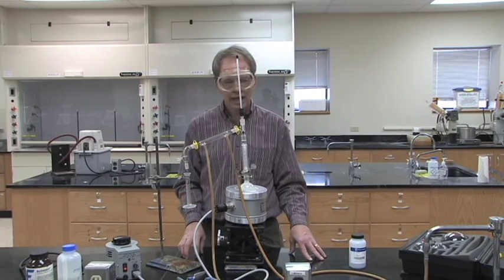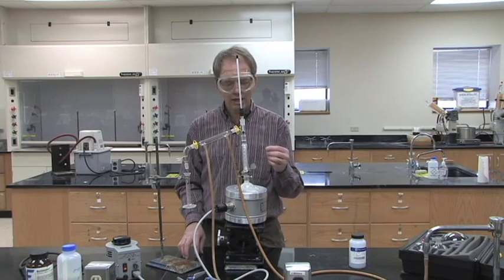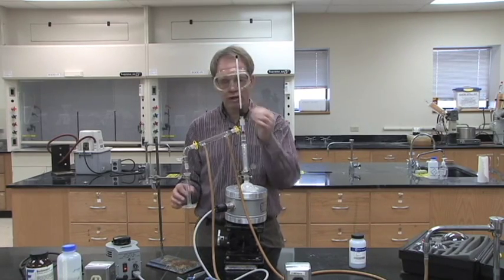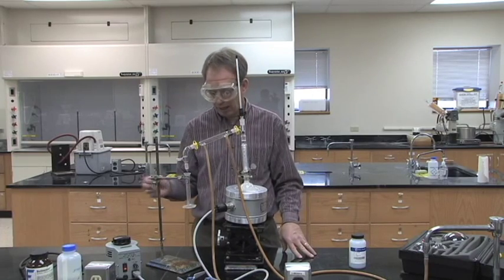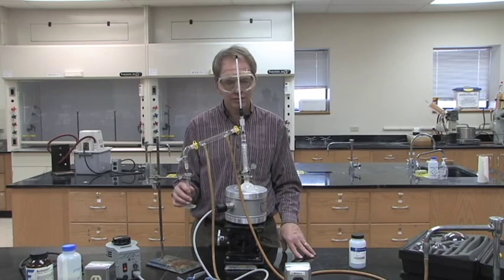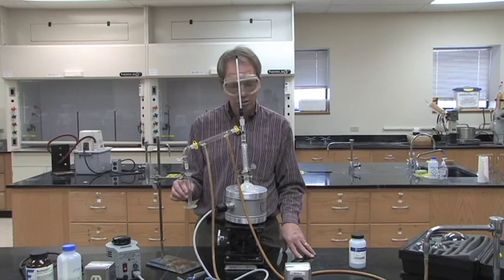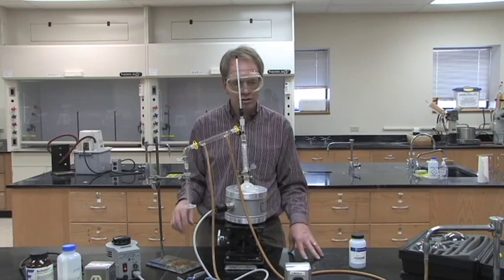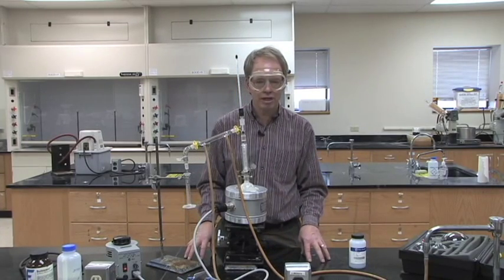When it starts to rise rapidly, what you'll do is switch from the first fraction, dump that out, and collect the second fraction. That'll continue to rise rapidly and then start to level off, and then you switch to your third fraction.